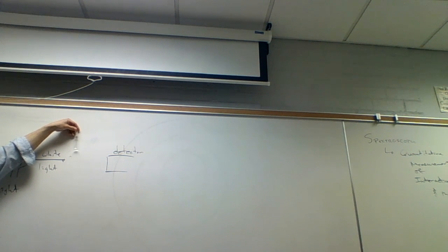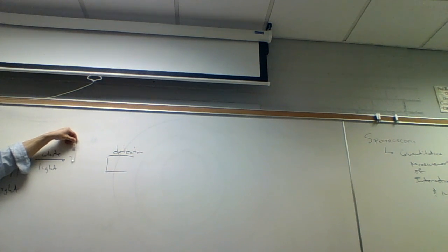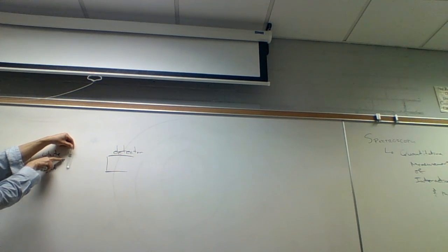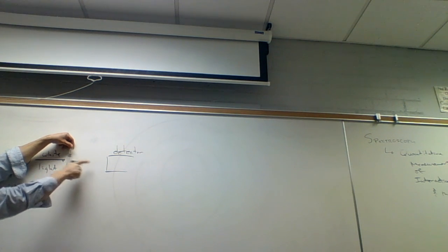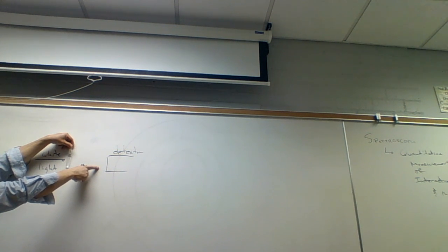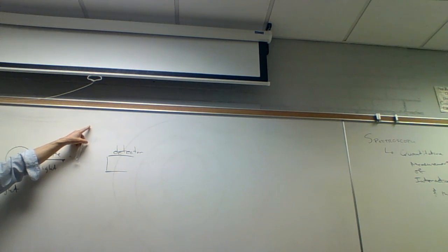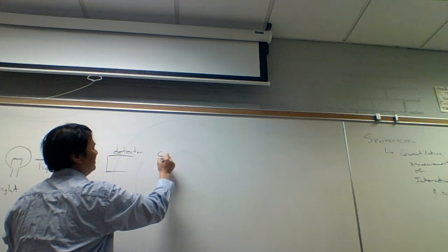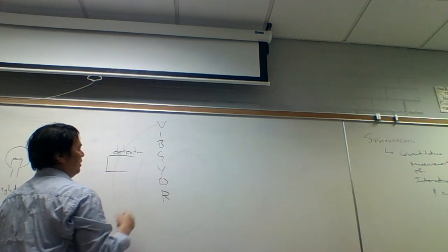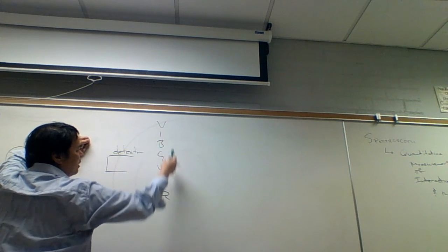And so the first thing we have to do is blank or zero the spectrometer. And so when we put this blank in here, then we have the maximum amount of white light hitting our detector. Right, the maximum amount of white light hitting the detector. And that we call a zero absorbance, basically. It is absorbing none of the colors of the rainbow. Now our detector is going to detect the spectrum. And so with our blank in there, it should just be a flat line. Now I'm going to tilt that on its side, looking at it vertically like this.